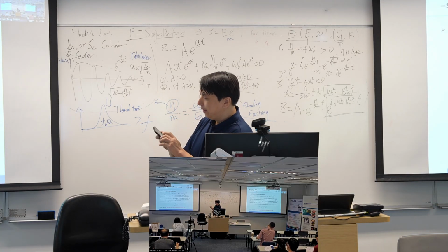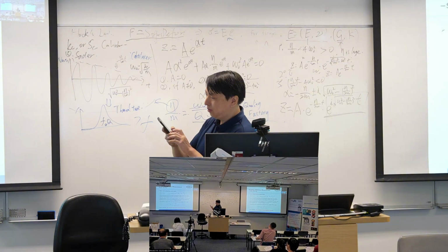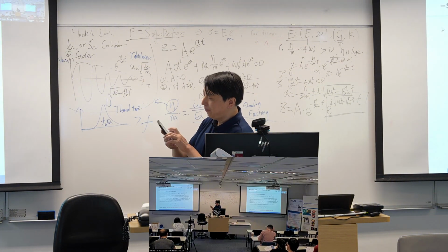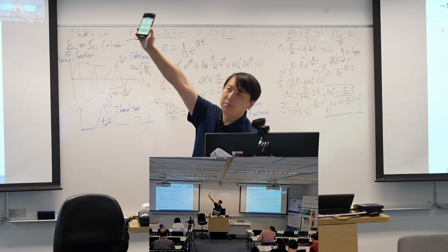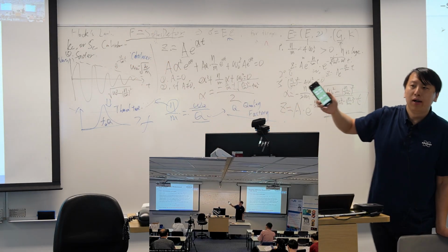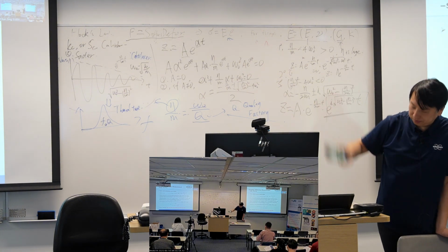For example, I write down the length is 120, the width is about 35, the resonance frequency I say 300, and the quality factor I give it 500, and I calculate. It gives me a spring constant, and then you can type it in the AFM software.